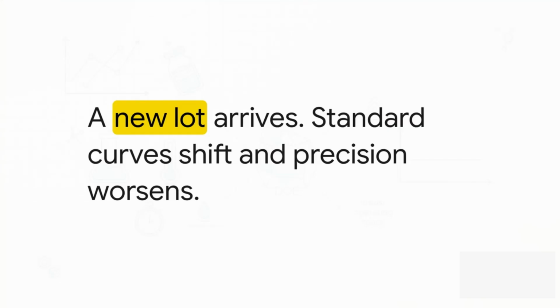You do a little digging and trace it back, and boom, there it is. A brand new lot of reagent was opened. Maybe it's a new capture antibody, a blocker, or a calibrator. Suddenly your standard curves are shifting all over the place, your sample recovery changes, and your precision just widens out. Panic sets in, mostly because this always seems to happen right when a method is practically ready for validation. It is without a doubt one of the most expensive kinds of variability a lab can face.